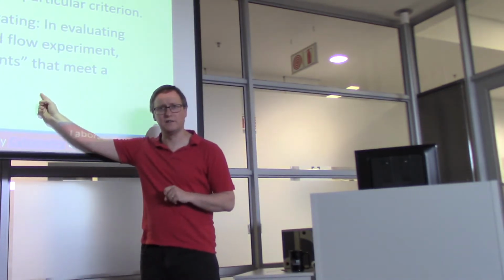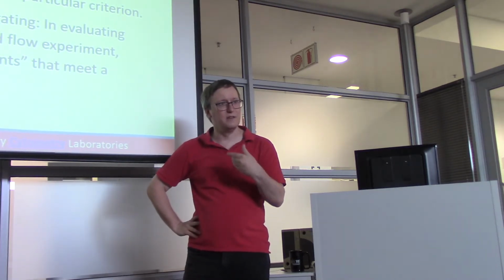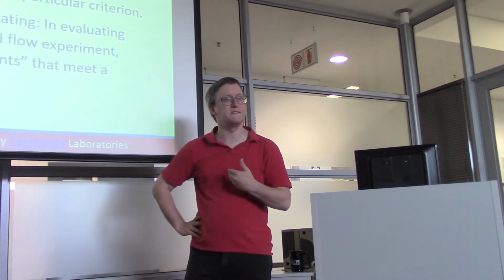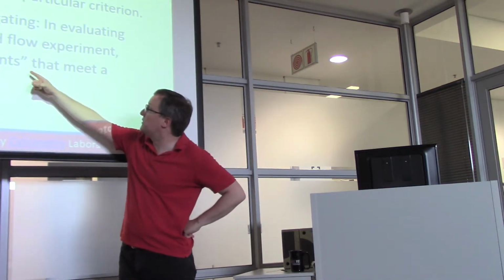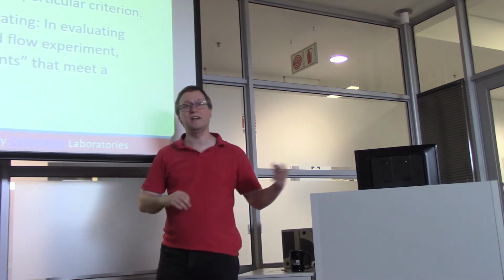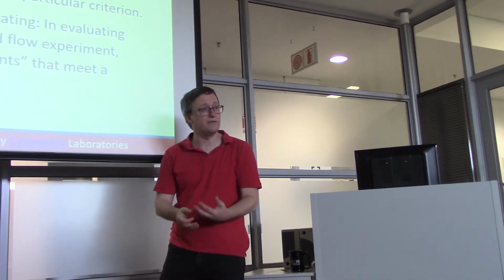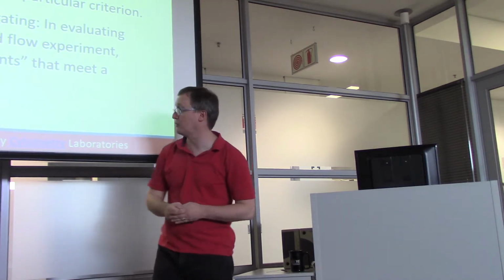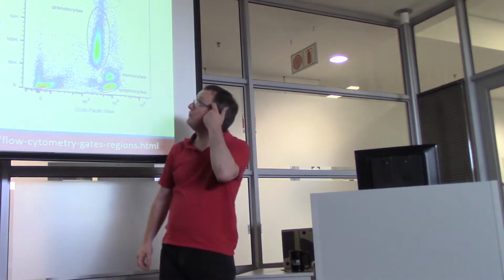On the other hand, we're going to use a lot of this gating to analyze the fluorescent responses that came from these individual events. So if we have completed a flow cytometry experiment, we can come back to look at what the fluorescent responses were for each of the dyes on each cell as it was passing through. And that's the example of software gating that we would talk about.